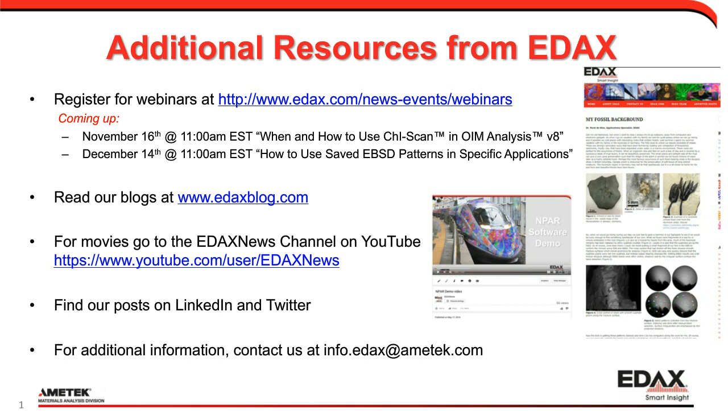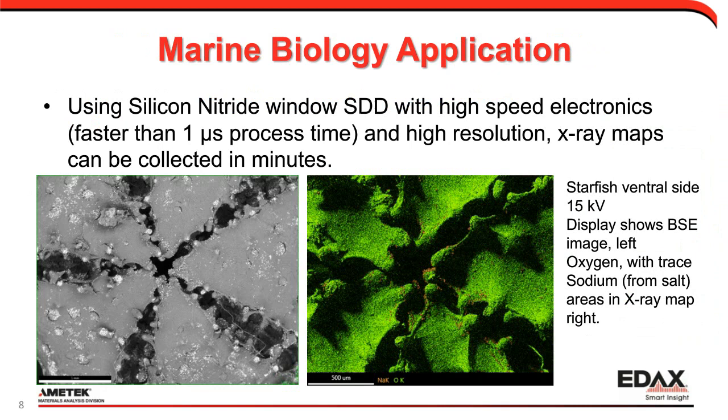So in the starfish image, the electron image shows a flat image, and we're working with backscattered electron images, which give us a flat look. It's also what allows the sodium chloride to stand out.